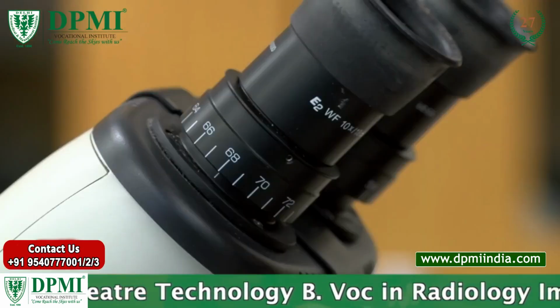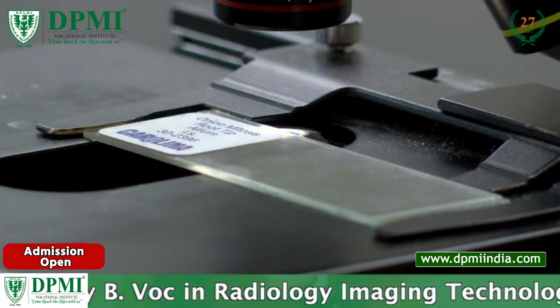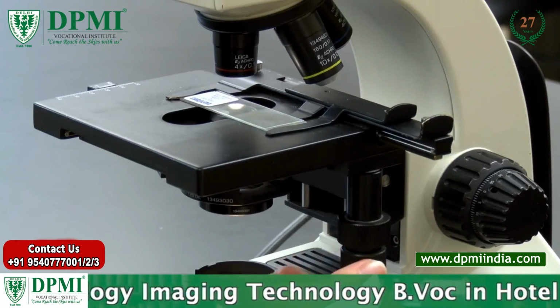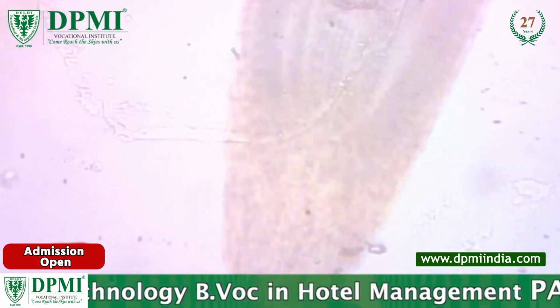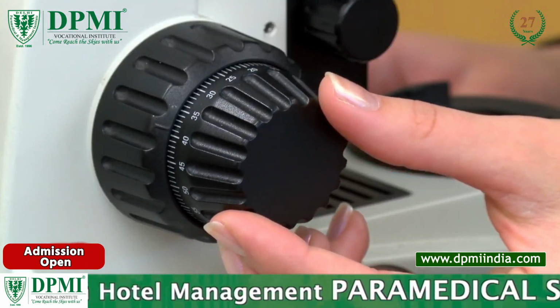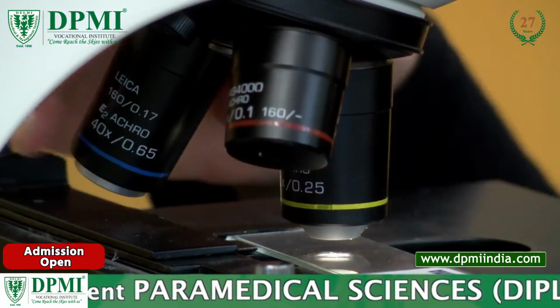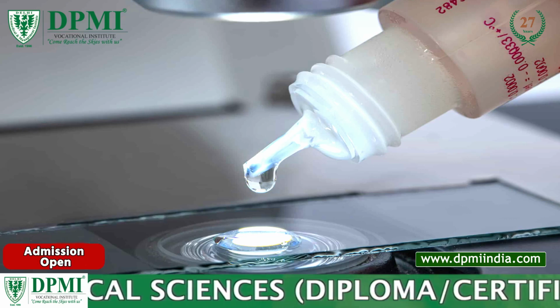Steps for using a light compound microscope: place the specimen on the stage, adjust the objective lens to the lowest magnification, illuminate the specimen using the light source, and use the coarse adjustment to bring the specimen into rough focus. Refine the focus with the fine adjustment, and increase magnification by rotating the objective lens. Use immersion oil for higher magnifications.